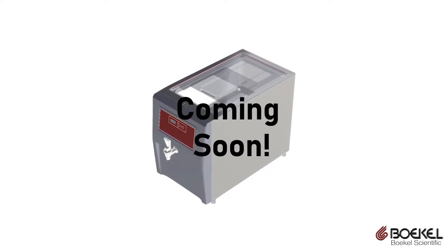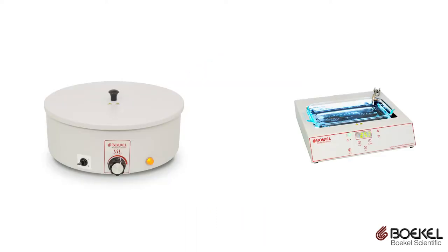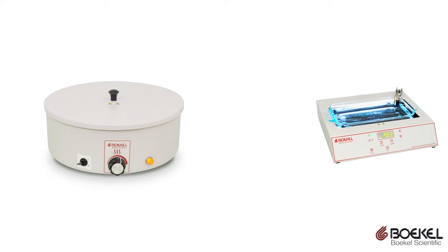Stay tuned for more details regarding this exciting new device. Bocal Scientific offers a variety of tissue flotation baths for processing tissue samples.